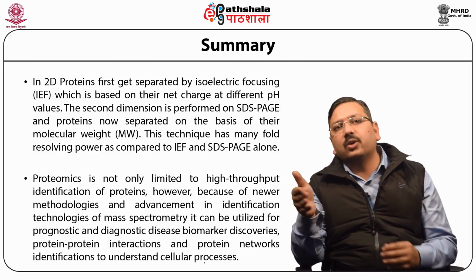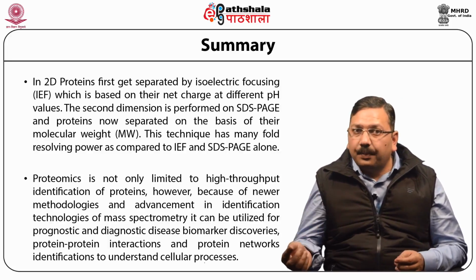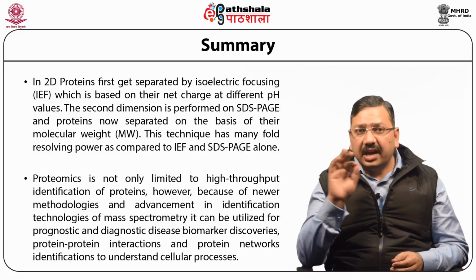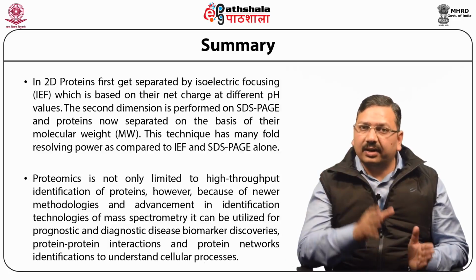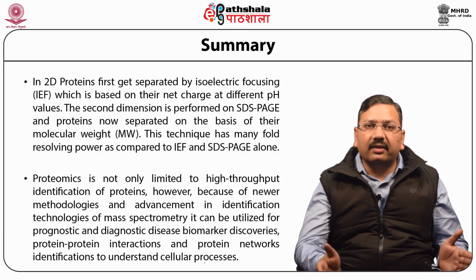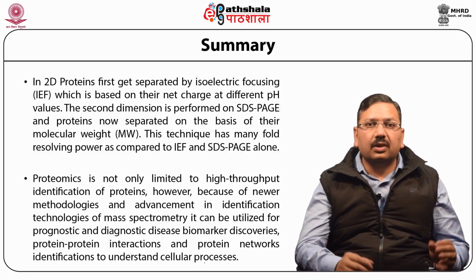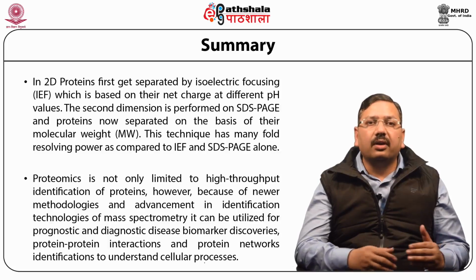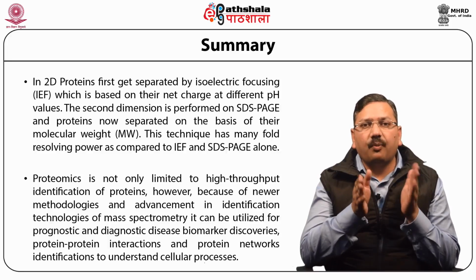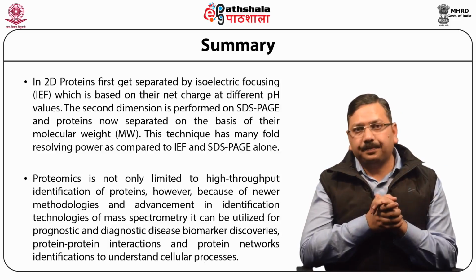Later on, newer technology came out that we call tandem mass spectrometry, which allows mass separation and amino acid identification of a compound in a complex mixture. It uses two or more mass analyzers which are coupled together, or in between, these are separated by a collision cell filled with argon or xenon gases. This collision cell is required for refragmentation of masses, and because of this you will find the amino acid identification.